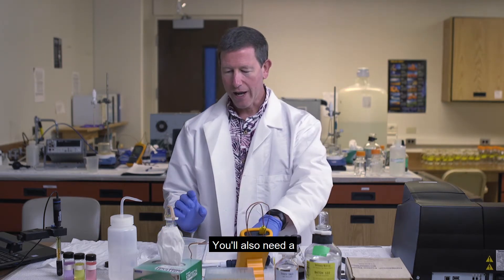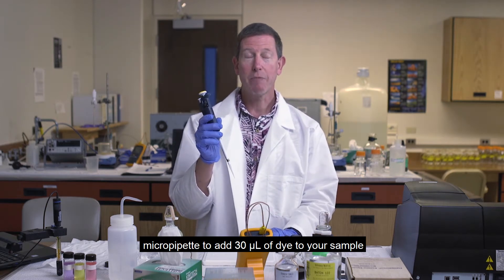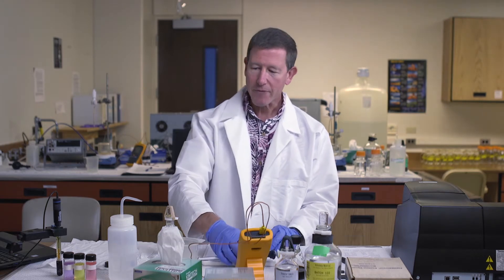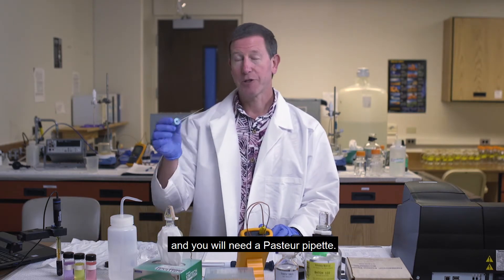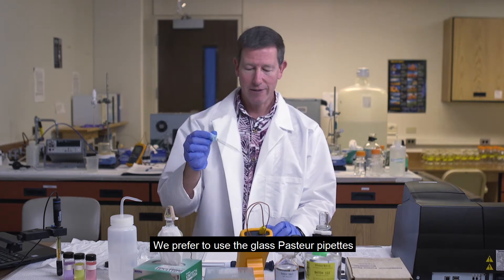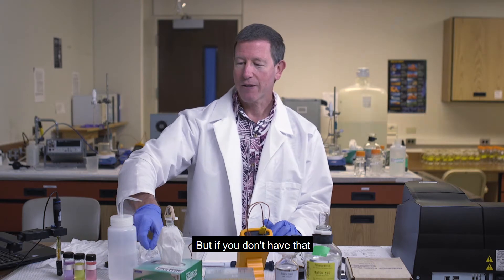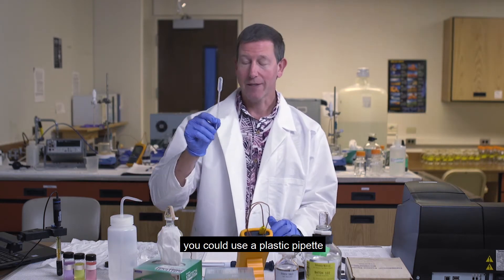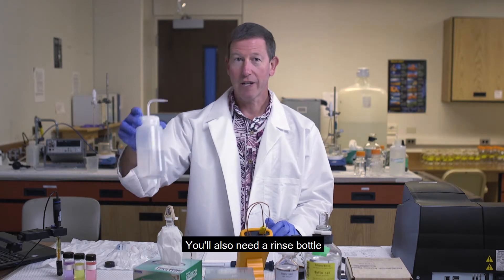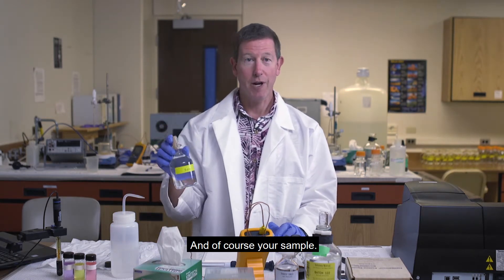You'll also need a micro pipette to add 30 microliters of dye to your sample, and you will need a Pasteur pipette. We prefer to use the glass Pasteur pipettes to add the sample to the cuvette, but if you don't have that you could use a plastic pipette — the glass one is preferred. You'll also need a rinse bottle to rinse everything out and, of course, your sample.